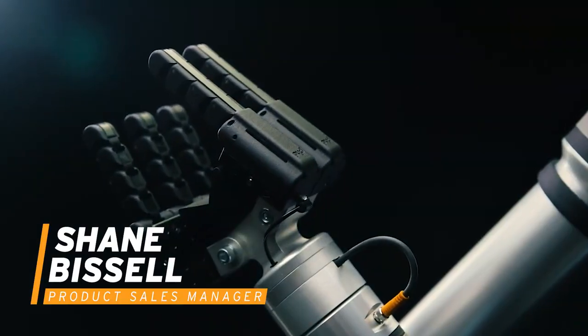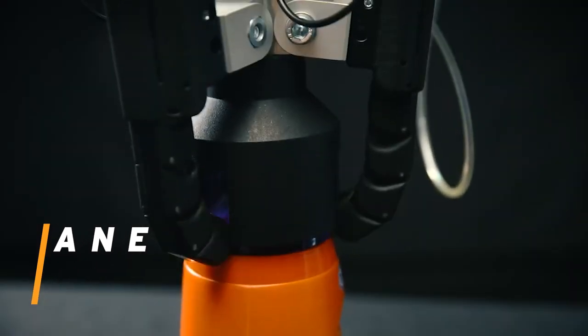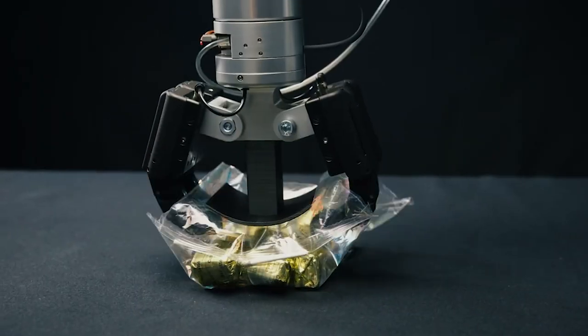In this video I'd like to introduce PHD's Flexion, a new technology inspired by the ultimate gripper, the human hand. Suitable for both collaborative and industrial applications, Flexion's configurable design allows for an unparalleled range of application ability and offers the potential to solve challenges that previously had no answer.